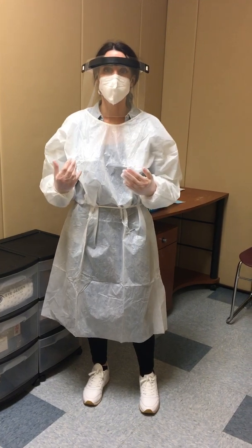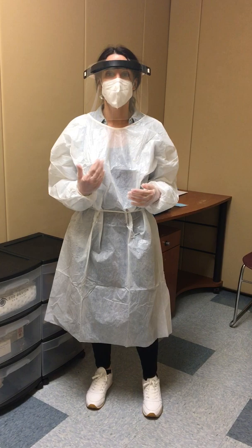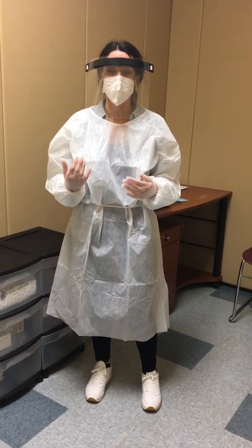PPE room, and I'm going to show you how I would remove this PPE. And again, this is going to be a different sequence because I am going to remove it as if I'm reusing some of this stuff.